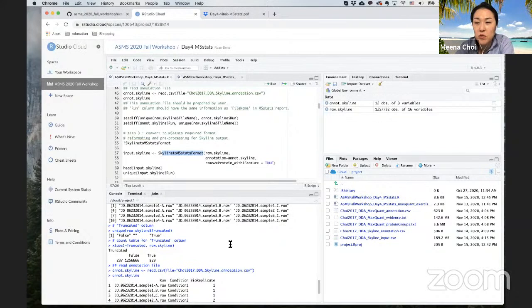For example, for the sequence group protein, sometimes they call it sequence, sometimes modified sequence, sometimes peptide; they define the column information in quite diverse ways. That's why we spent a lot of time to unify these converters to make the MSstats format, and to decide which information is most useful and which information we have to use. So I personally recommend you use the tool-specific converter in MSstats, even though you can make your own converter, because sometimes your converter can still generate errors for the next functionality.